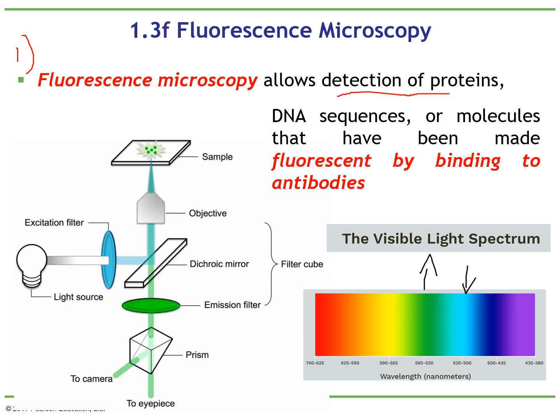And you can also have a different protein for the chromosomes. Let's put an M right here, an M for microtubules. But you said I also want to see the chromosomes, so you can label the histone, you can excite the histone with a green laser, and then this will emit a red color.